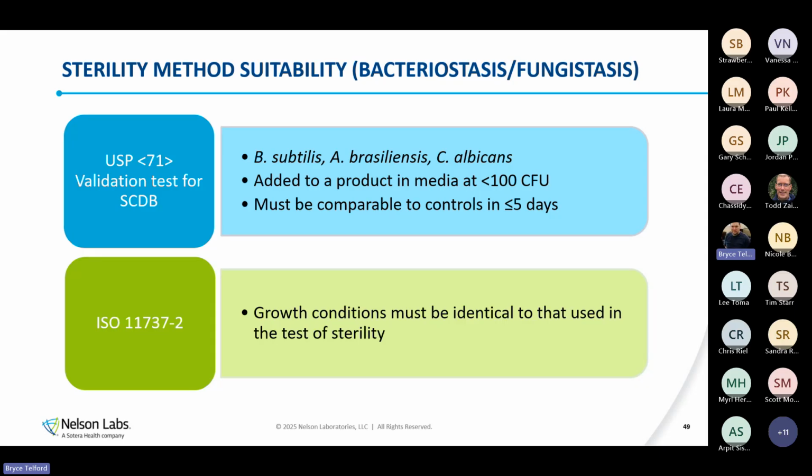So generally, there's going to be some level of us either trying to neutralize whatever the inhibitory substance is. We can try diluting it, so increasing our sterility testing volume. That only works to a point because we only have containers so large, or a combination of the two. We might try a neutralizer and we might just throw all the volume we can at it.